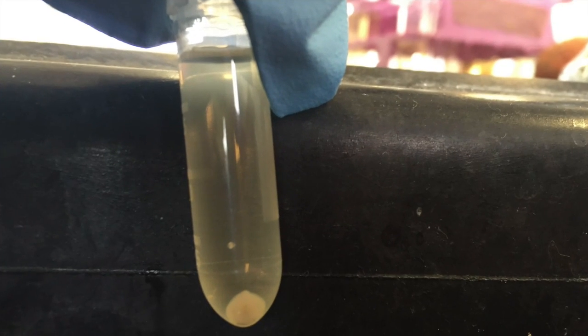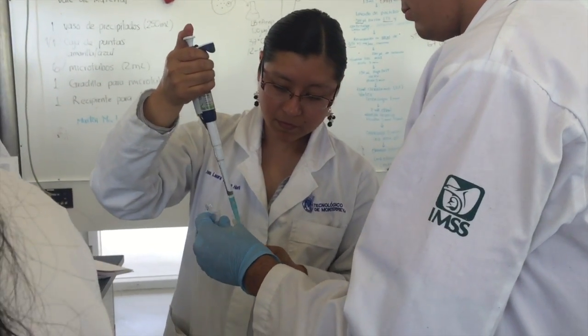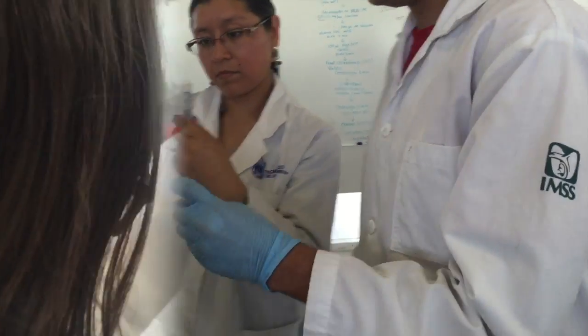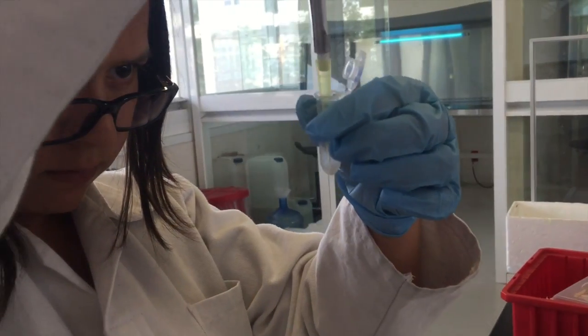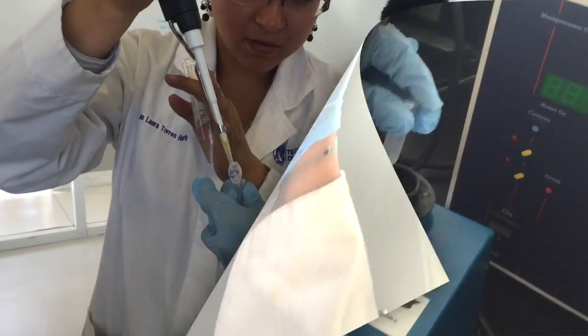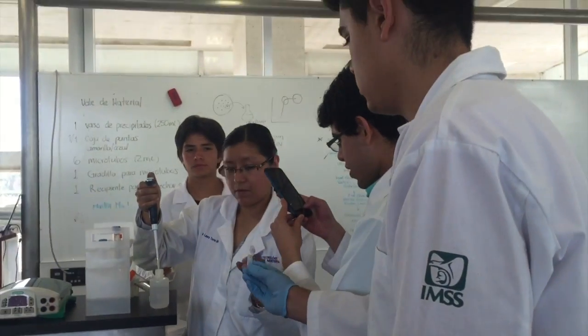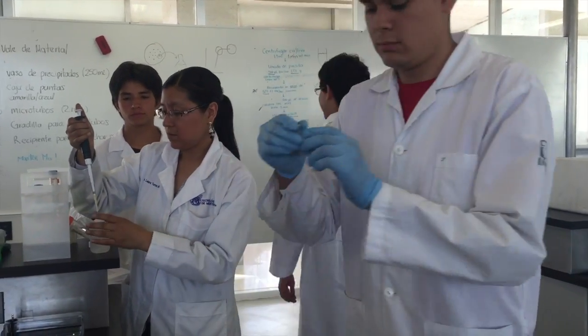1.5 milliliters of the culture was centrifuged for 20 seconds at high speed in order to obtain a bacterial pellet. Then 100 microliters of the GTE solution were added in order to resuspend completely and correctly the pellet. Then the solution was complemented with lysozyme and mixed with the vortex. Also 200 microliters of SDS alkaline solution and 150 microliters of high salt solution were added.